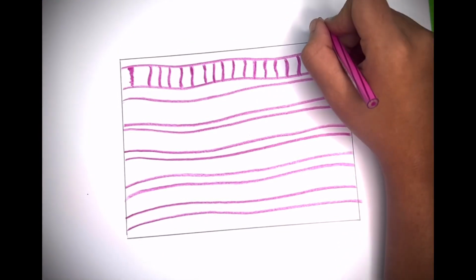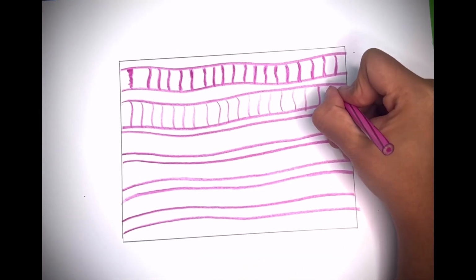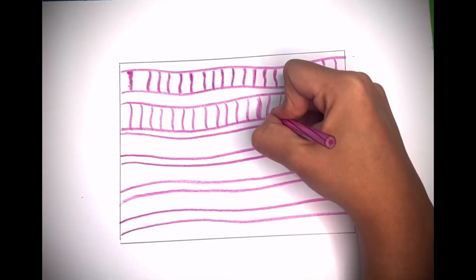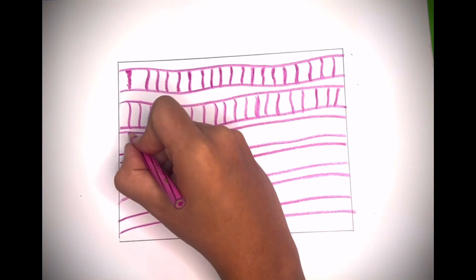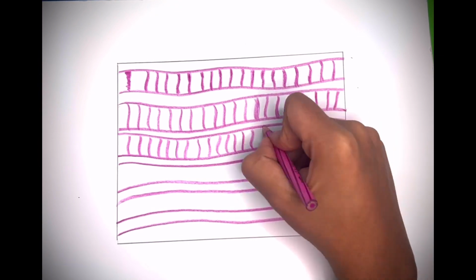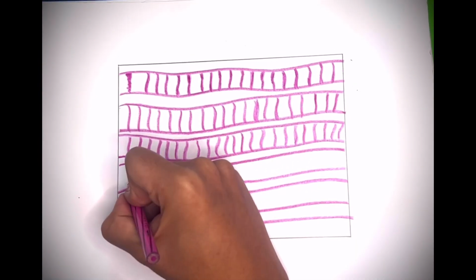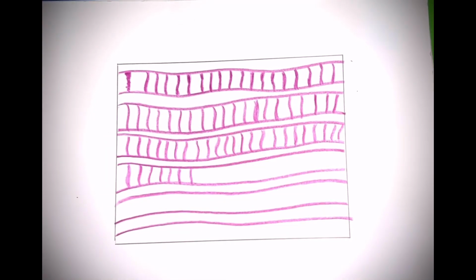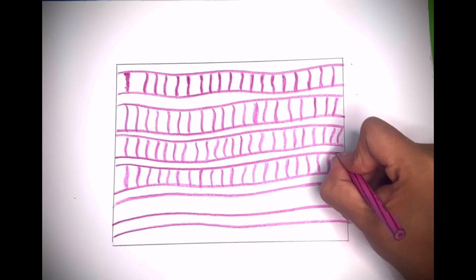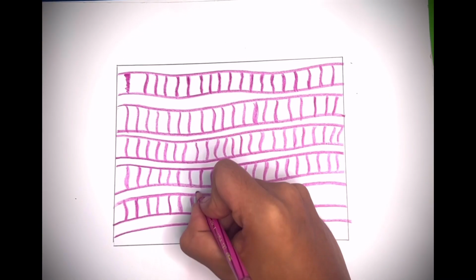The nuclei are elongated and they lie on the periphery. So, why are the nuclei on the periphery? The cytoplasm, which is the sarcoplasm, is filled with numerous longitudinal fibrils that are called myofibrils. The presence of these myofibrils in the sarcoplasm pushes the nuclei to the periphery underneath the sarcolemma. So, this is why we can observe peripheral nuclei in skeletal muscle.